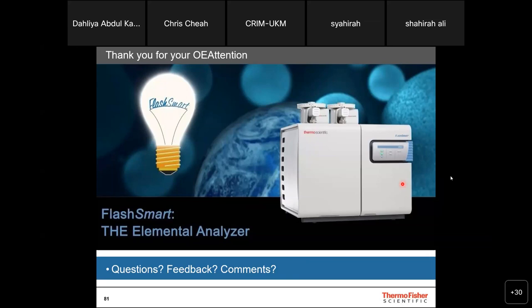Thank you, Chris. There's one question in the chat box from Tusha. She's asking, I'd like to know if I can use the elemental analyzer to identify whether my chemical attached to the target chemical I want. The answer is no, because the elemental analyzer is a bulk analyzer. It only gives you a total content, but it won't give you information about what the organic compound is, or whether you managed to modify it or attach a certain modification to your original compound. So you might need to use technology like GCMS or LCMS to determine based on molecular weight.